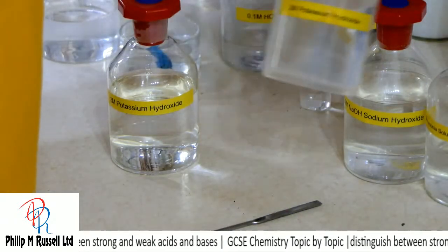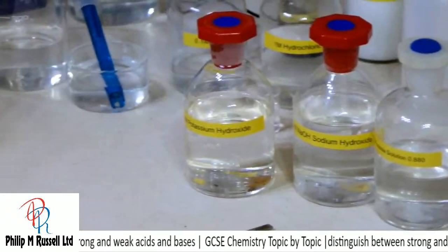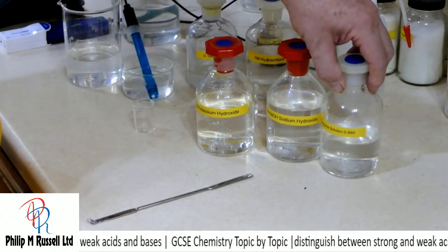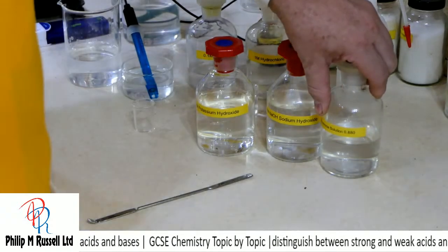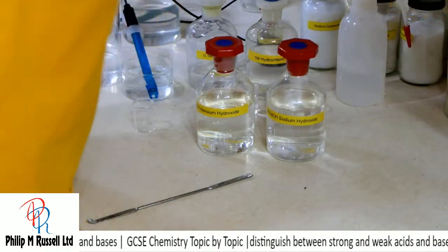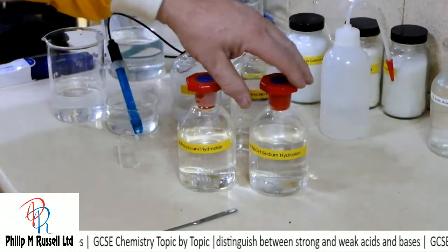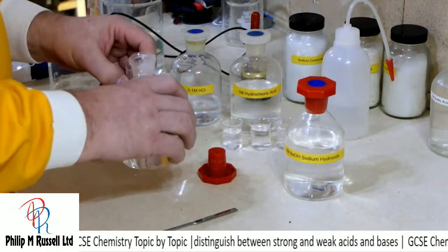So there's my old, I've got my new. Now let's try having a look and see what one of those looks like. I'm not going to do the ammonia because you can't smell how bad that smells, but we can here, and the vote was not to do that one today. And we can have a look at either potassium or sodium hydroxide. There's not a lot in it. We've got some nice new potassium hydroxide. Let's have a look and see what this is.